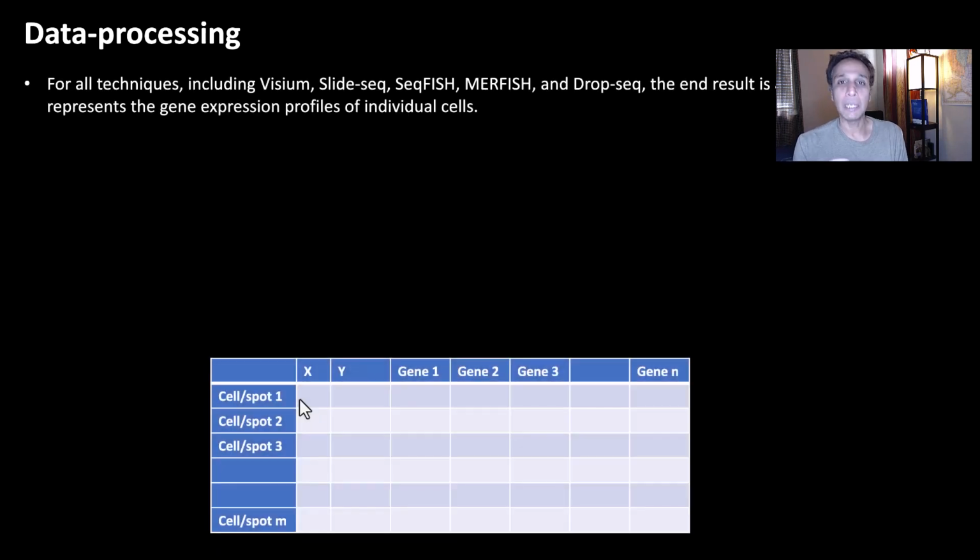With your own coding, you can, of course, extract any type of custom information. Okay, so as I mentioned, no matter what technique, I only mentioned Visium. By the way, 10x also does, and others also do, another method. It's like Drop-seq, for example.